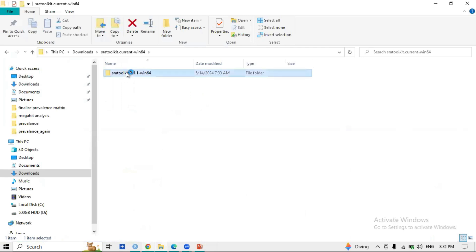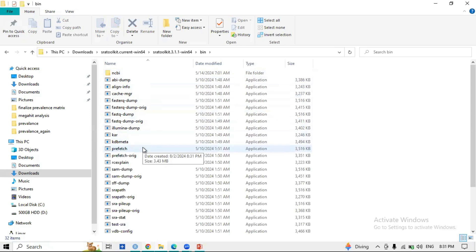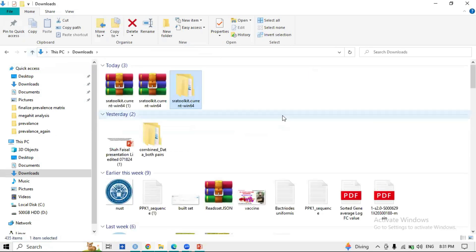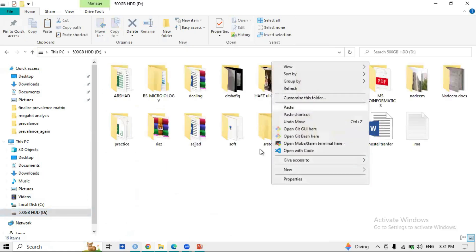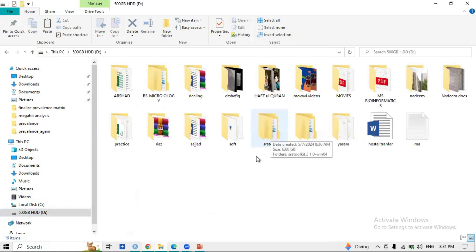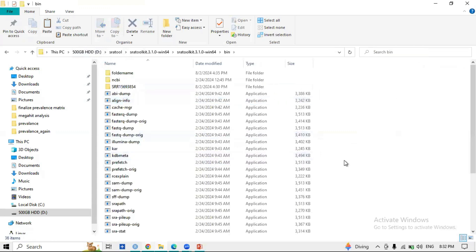After extracting, it consists of a bin folder, example folder, and schema. The commands used to download files are present in the bin folder, so we will use specific commands from this folder to download the FASTQ file. If you want to download your files to the D drive, copy the SRA Toolkit folder and paste it into your D drive. I have already placed it there — this is my D drive, and this is the SRA Toolkit with its bin folder inside.